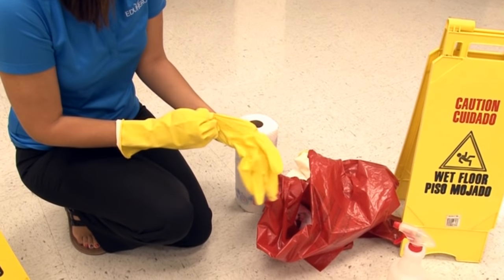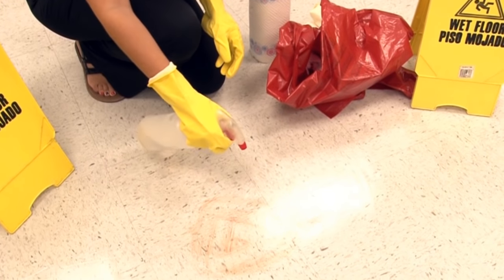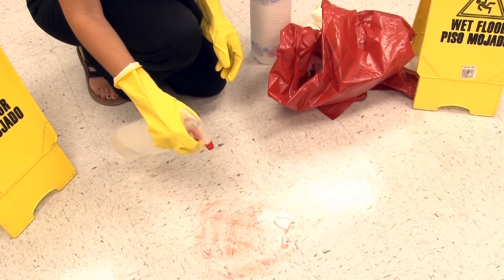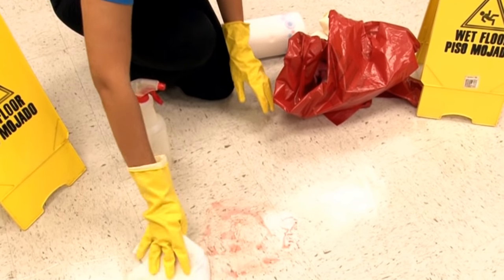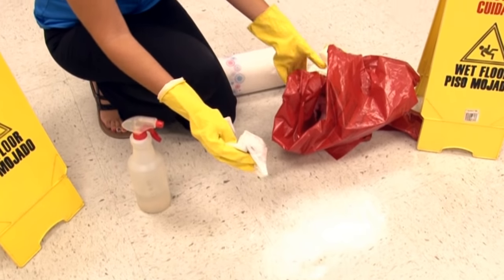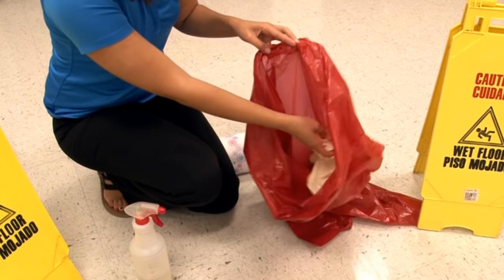Put on a new pair of gloves and thoroughly spray the contaminated area with bleach solution, being careful of your surroundings. Let it stand for a couple of minutes. Use more paper towels to wipe the contaminated area again, then dispose of the used paper towels and your second gloves in the biohazard bag.